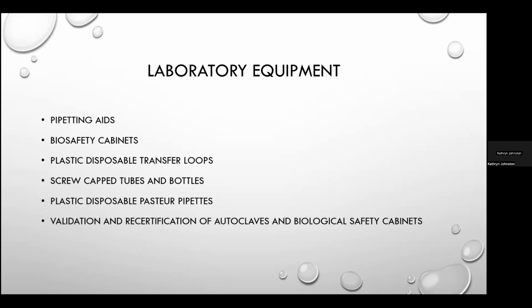Also use one when procedures with a high potential for producing aerosol are used. This typically includes centrifugation, grinding, blending, any vigorous shaking or mixing, sonic disruption, and opening of containers of infectious material. Those are the times when you should be using biosafety cabinets.